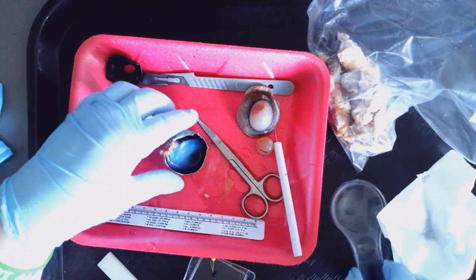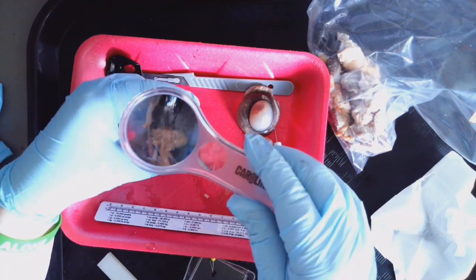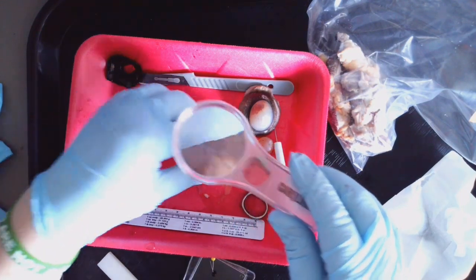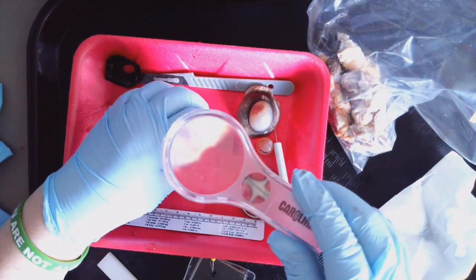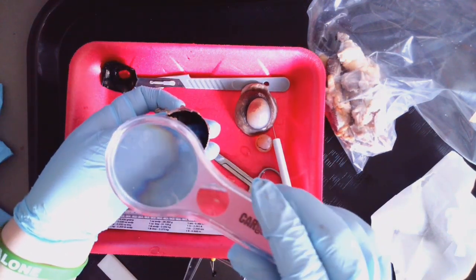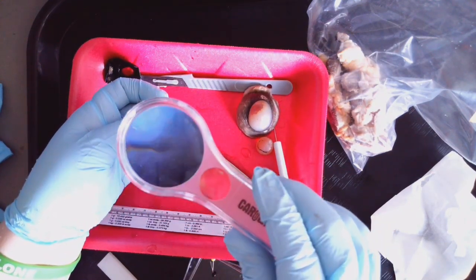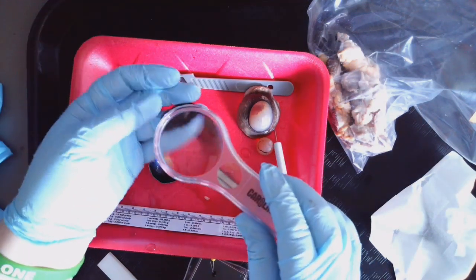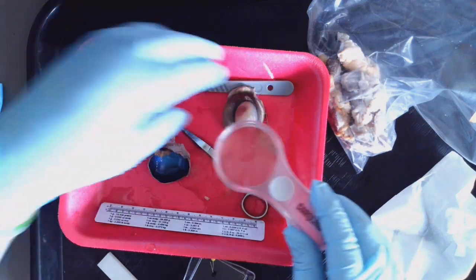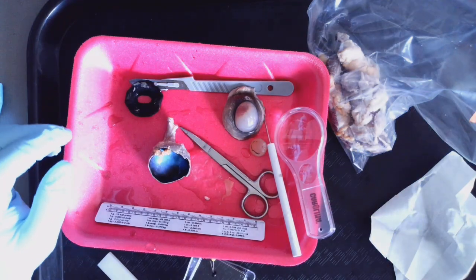Okay, again at this point, if you would like, you can use this hand lens to get a better look at anything that you were looking at before we do our final cleanup, right? So if you wanted to look at the optic nerve closer, or the retina closer, or the tapetum lucidum, whatever you wanted to look at, the iris and those ciliary muscles, the lens, whatever it was. If you want to use this, that is a tool that is available to you.